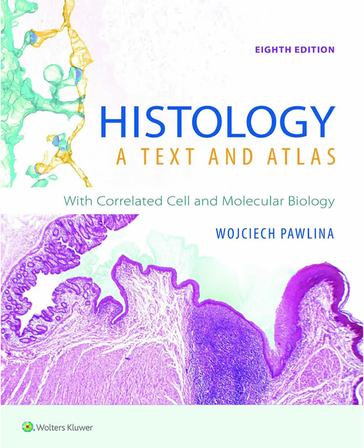Okay, so that's proteins. What about DNA or RNA sequences, genes? For that, we turn to hybridization techniques. The principle here is using complementary base pairing, A with T, G with C, in DNA.